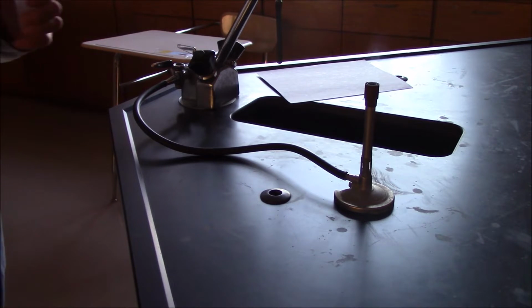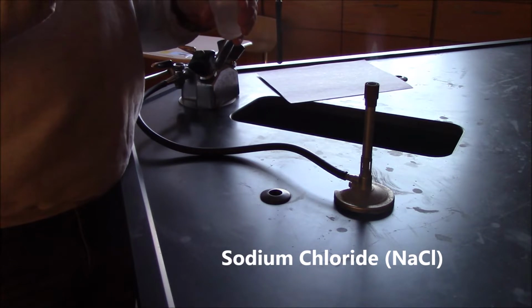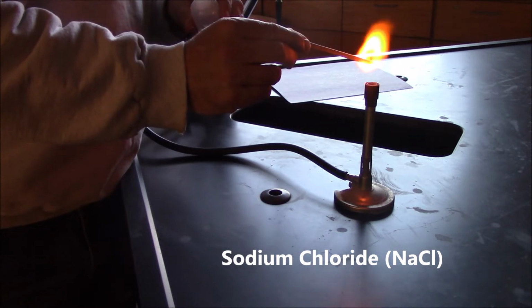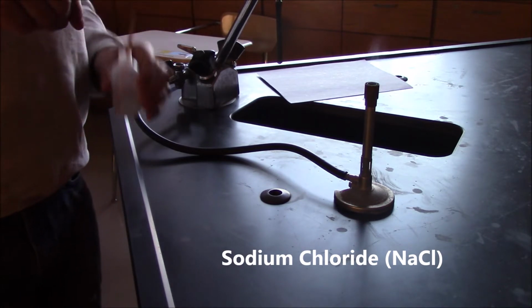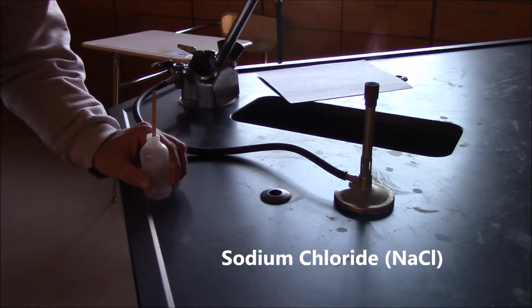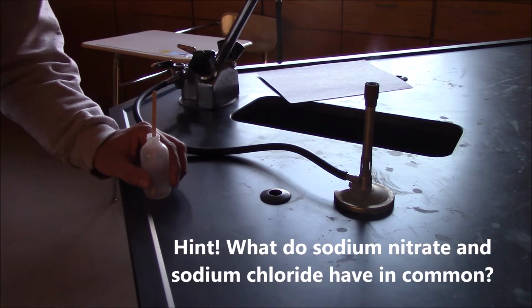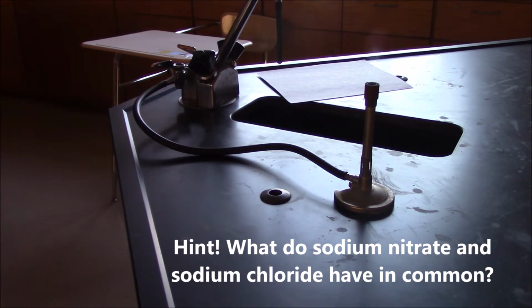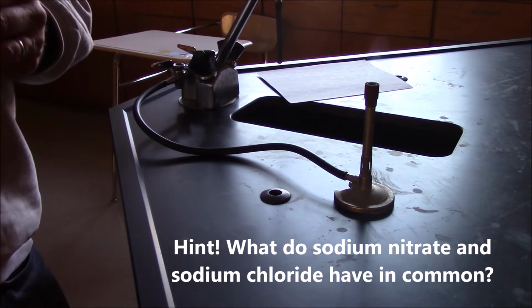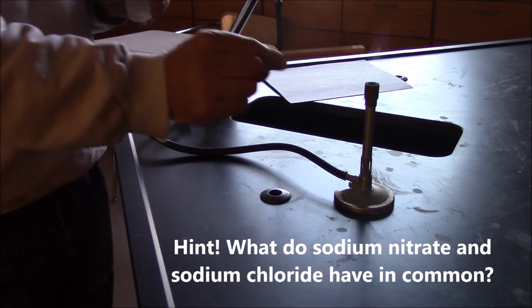Next up is sodium chloride. So first was sodium nitrate. This is sodium chloride. And you'll notice what you notice. And then you might wonder, well, why did you show us two with the same? Well, one of the early questions you're going to be asked is whether it is the positive or the negative ion that's responsible for the color. So this will help give you some information so you can not only give an answer but justify it.